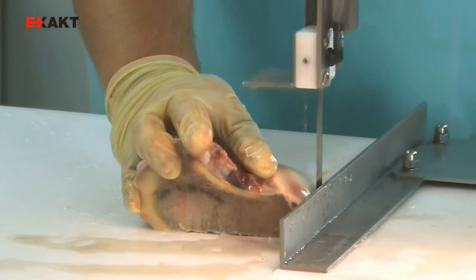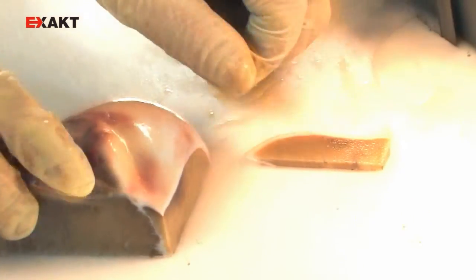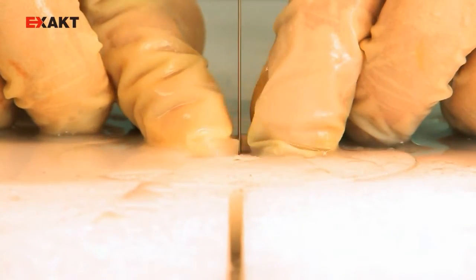This saw really raises the standard when it comes to occupational safety. Operating the saw is an almost intuitive process. Extremely precise incisions preserve all the relevant information required for histological analysis. The diamond blade doesn't cut — rather it grinds very finely and precisely.